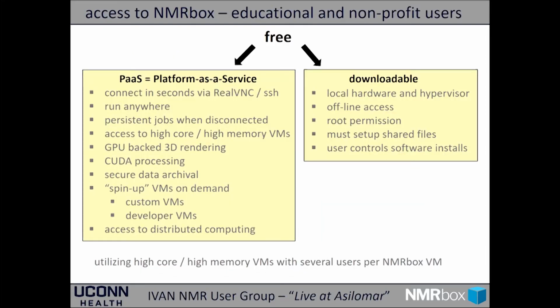So who can access NMRbox? Currently, NMRbox is only available to academic users and to nonprofit users, and government, I should say, as well. It is not available to commercial entities at this time, maybe in the future. It is 100% free for the users, and there are two different ways it can be accessed.